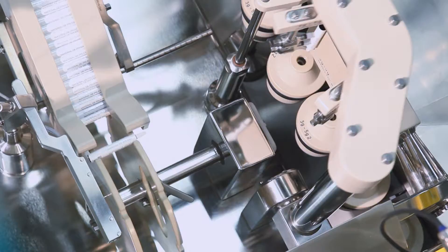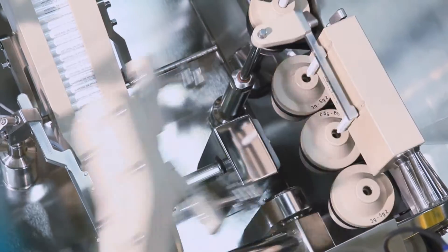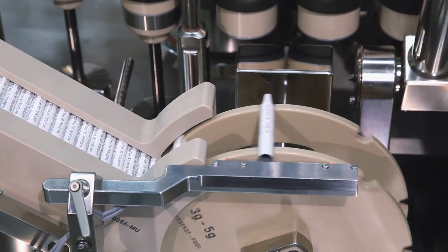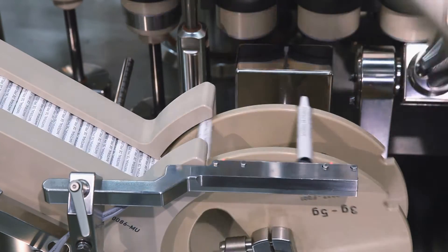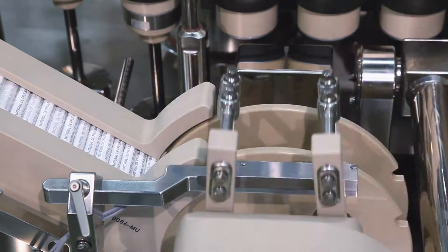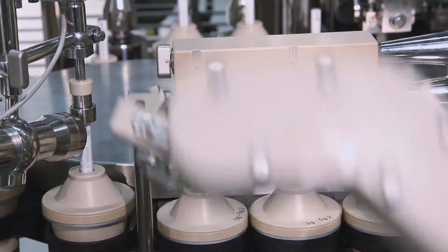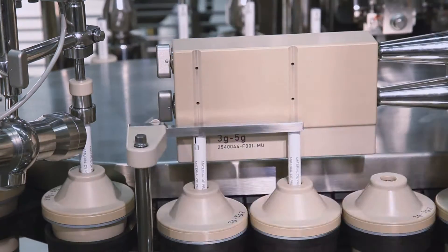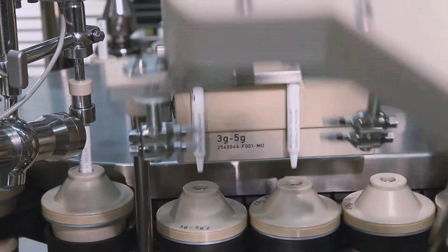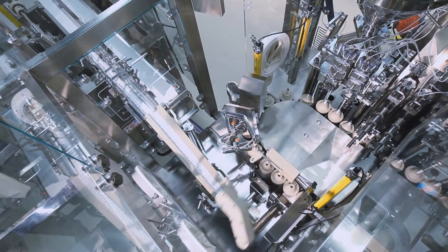All format parts within the machine as well as the format part for the tube infeed are made from PEEK material, which allows sterilization with temperatures up to 130 degrees Celsius. In the sterile execution of the FP tube filling platform as well as the TZ tube unloader, stainless steel 316L is used above the table plate, which allows H2O2 sterilization of the machine.